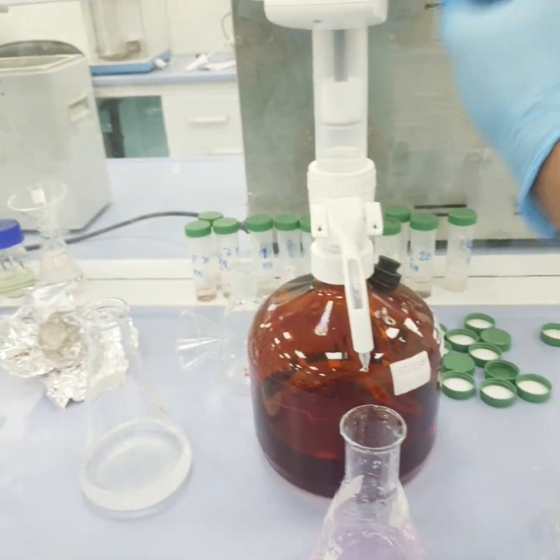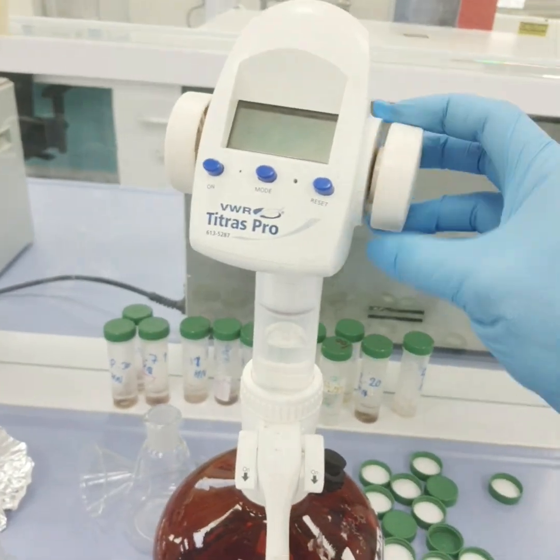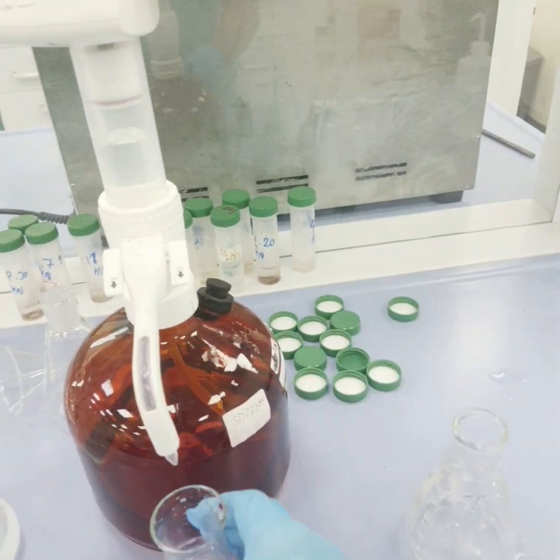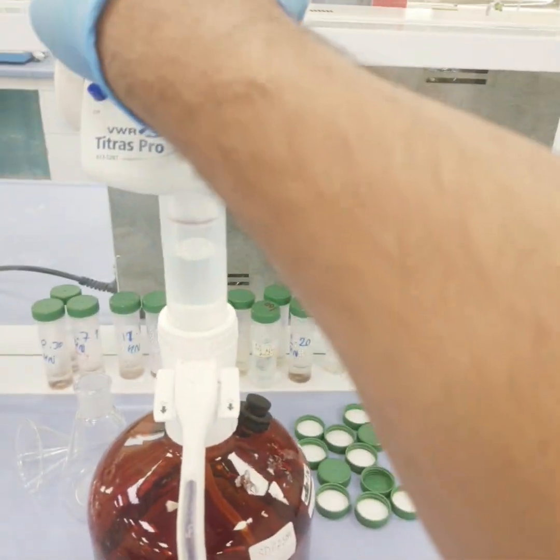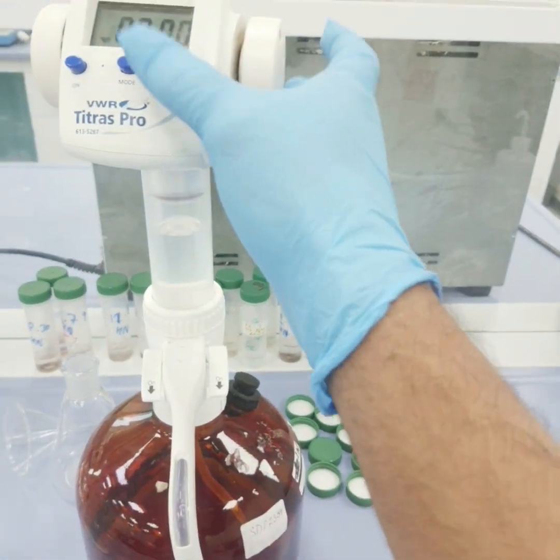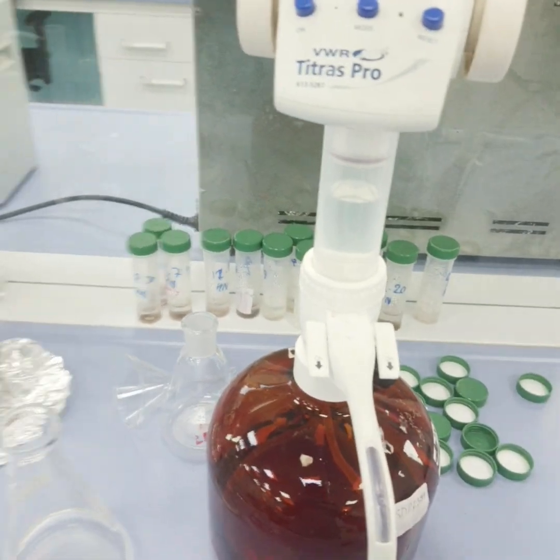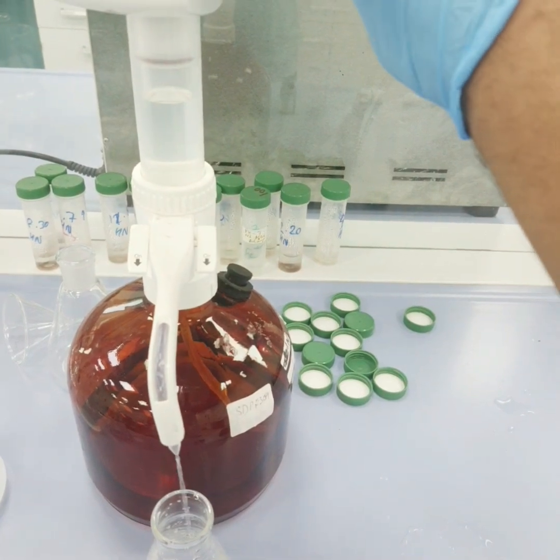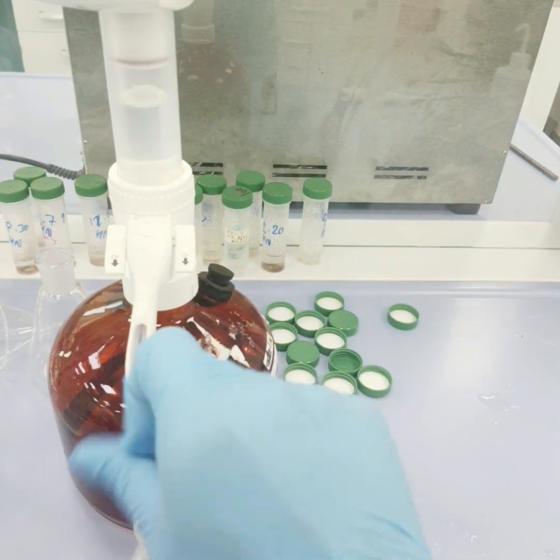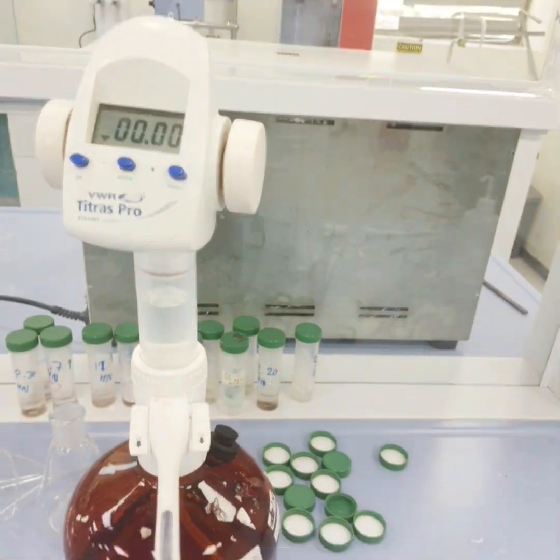Now you can see this is my titrator, and this solution is already standardized using the calcium carbonate solution. Now you can see it's already zeroed, and also make sure it has no entrapping of air bubbles. Again reset.